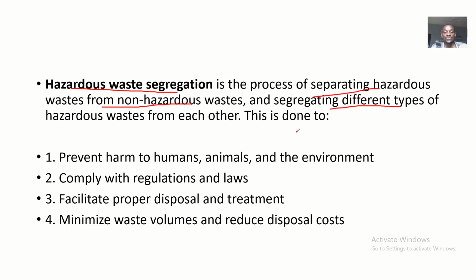Do you understand? So this is done to what? What is the benefit of doing this? Being careful with the waste that comes out of the laboratory prevents harm to humans, animals, and the environment. It avoids unnecessary reactions that you don't want to see. You are also complying with the regulations and laws of the laboratory.